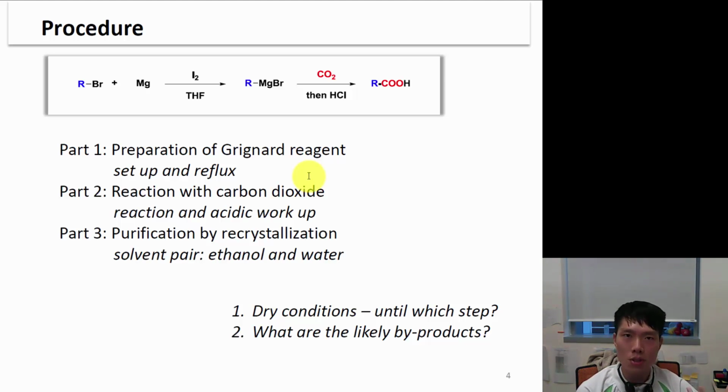How do you put the CO2 inside? Do you blow it from a mouth? We have CO2, right? Breathing, respiration, but we don't do that. Why do we have to acidify the workup? And part 3, we need to purify our substance.